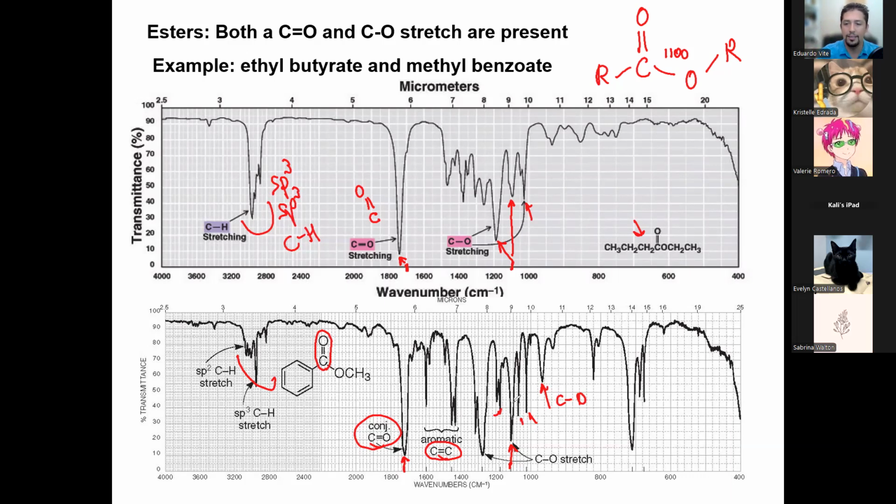It's a puzzle. We don't know for sure that any of these peaks are exactly like that one. As you saw, the molecule can vibrate in all sorts of different ways. We would have to sit down and do the math to find out exactly which vibration corresponds to that specific wave number. So that's why we don't pay too much attention to all of the peaks, only the very characteristic peaks. Any more questions about this?